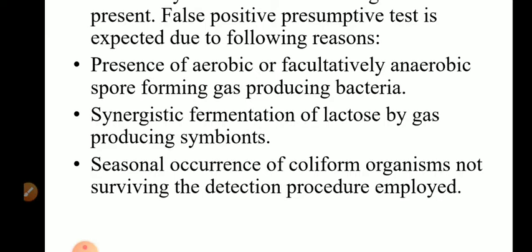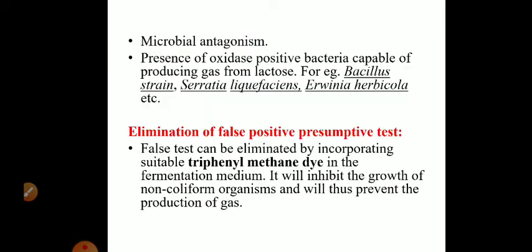The gas production may be because of synergistic fermentation of lactose by gas producing symbionts. There may be seasonal occurrence of coliform organisms not surviving the detection procedure employed.